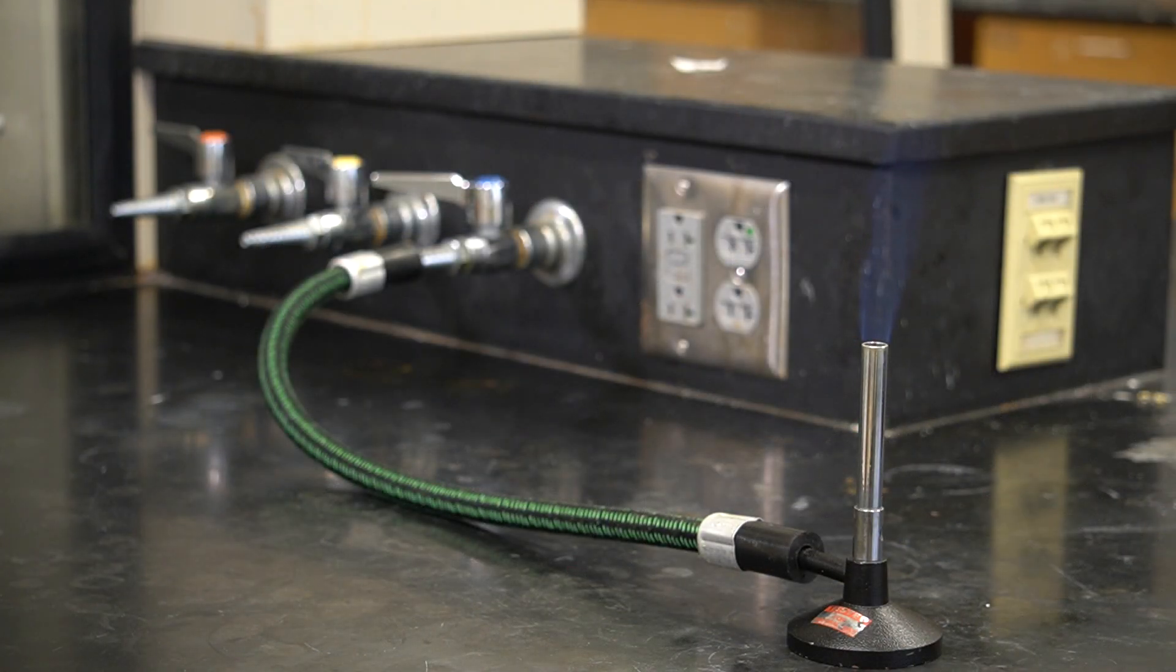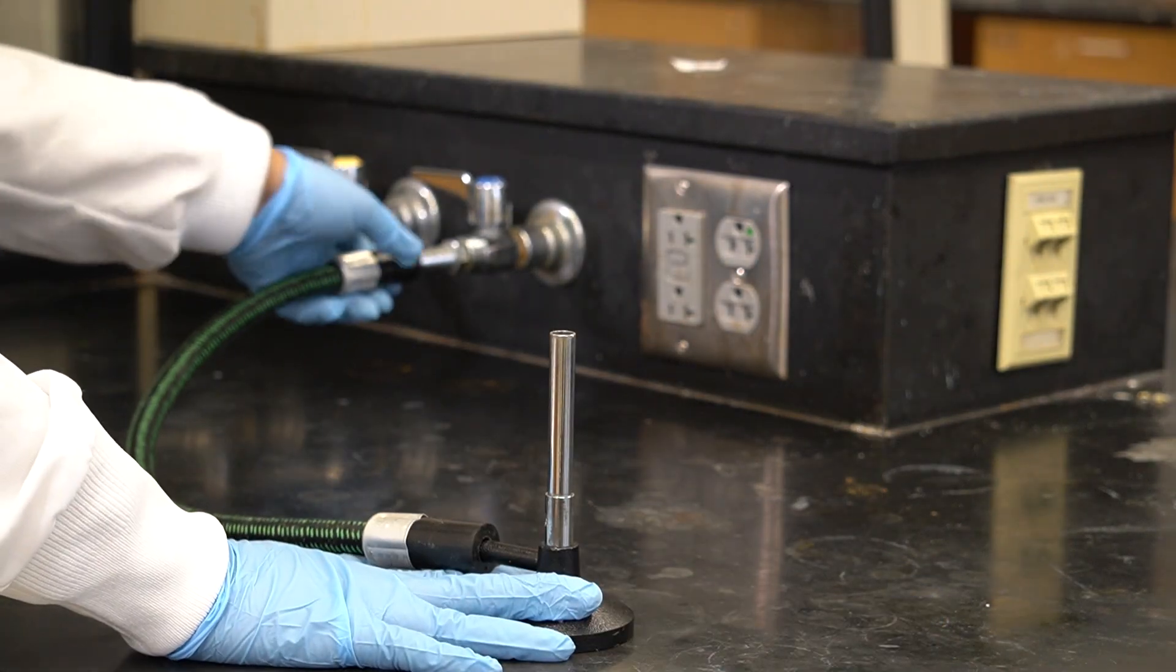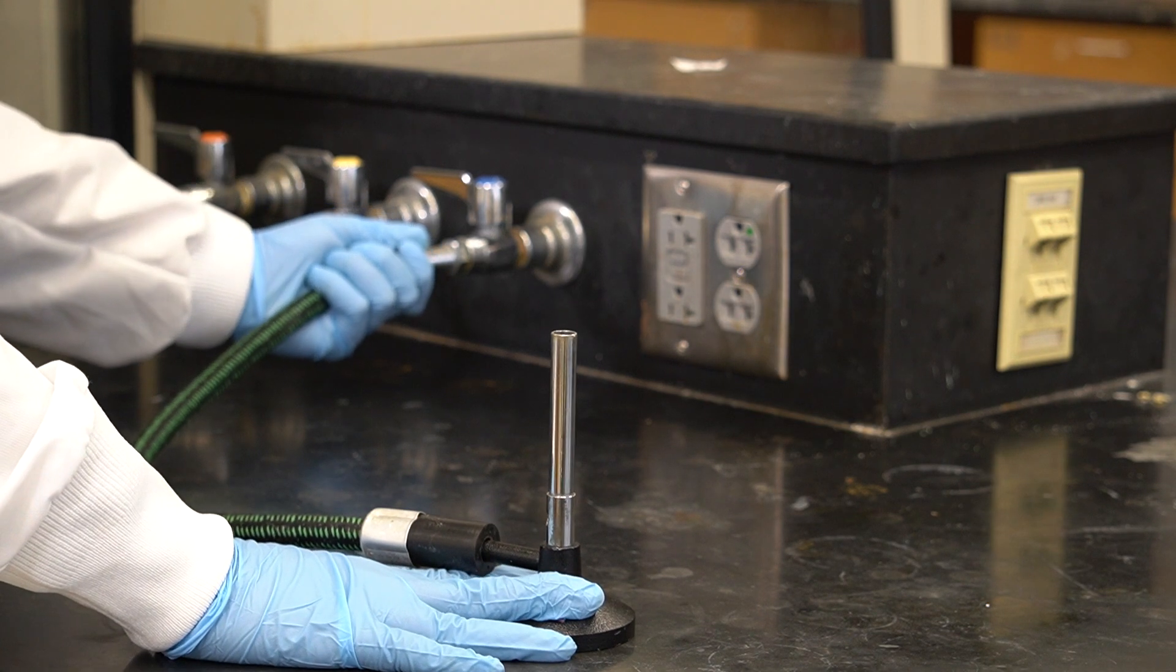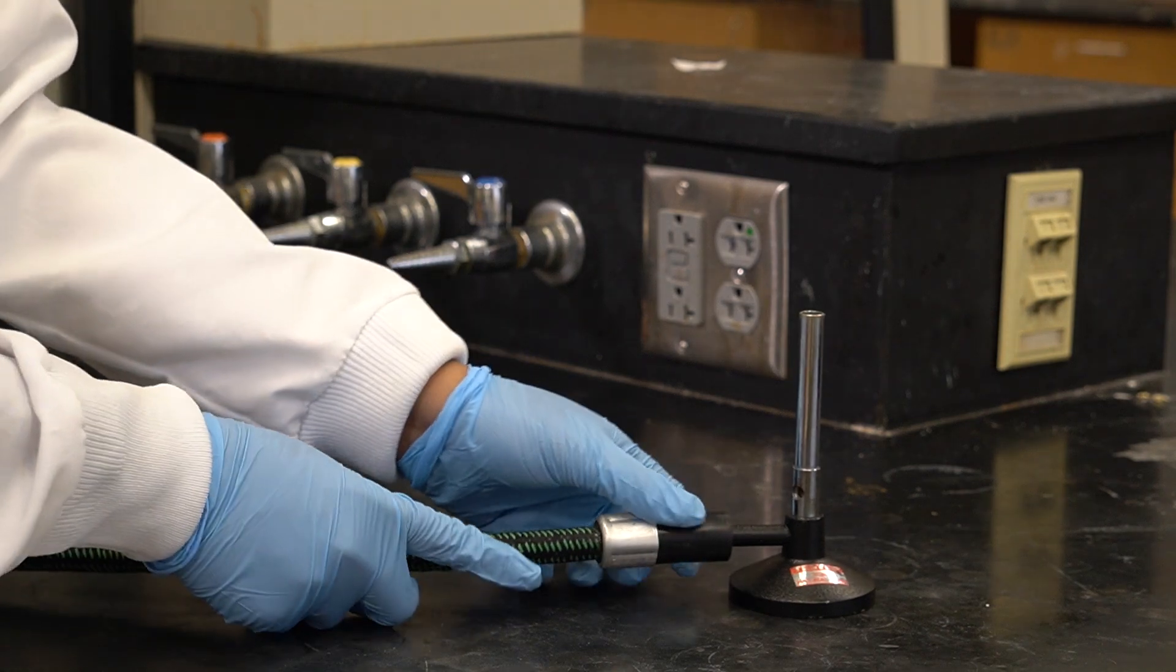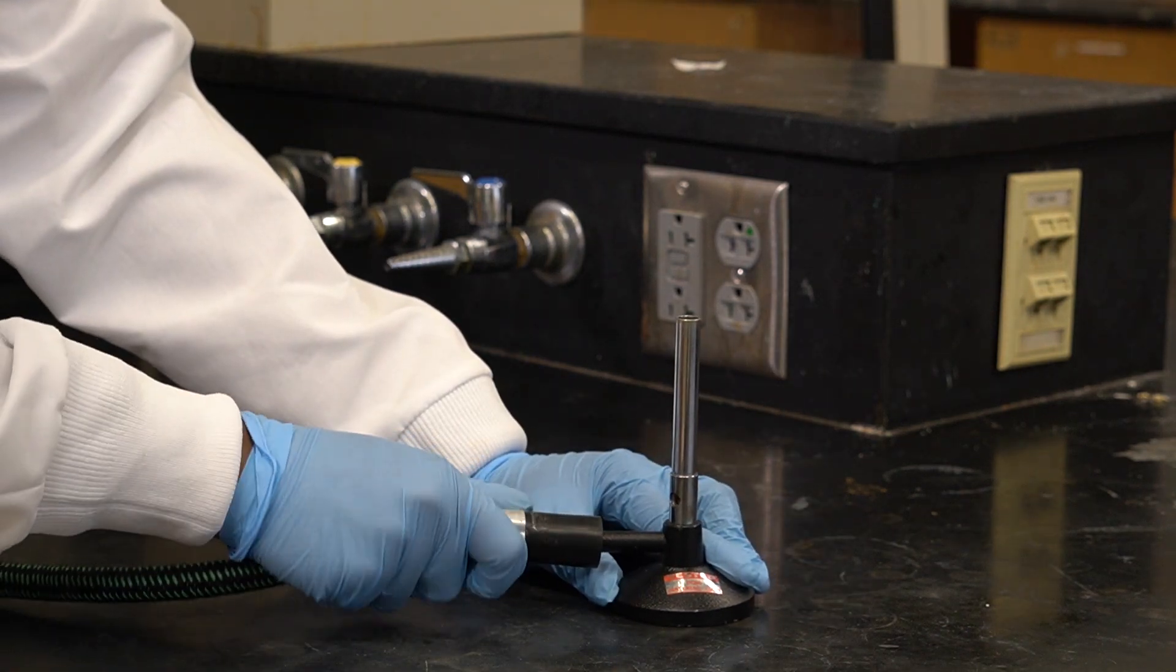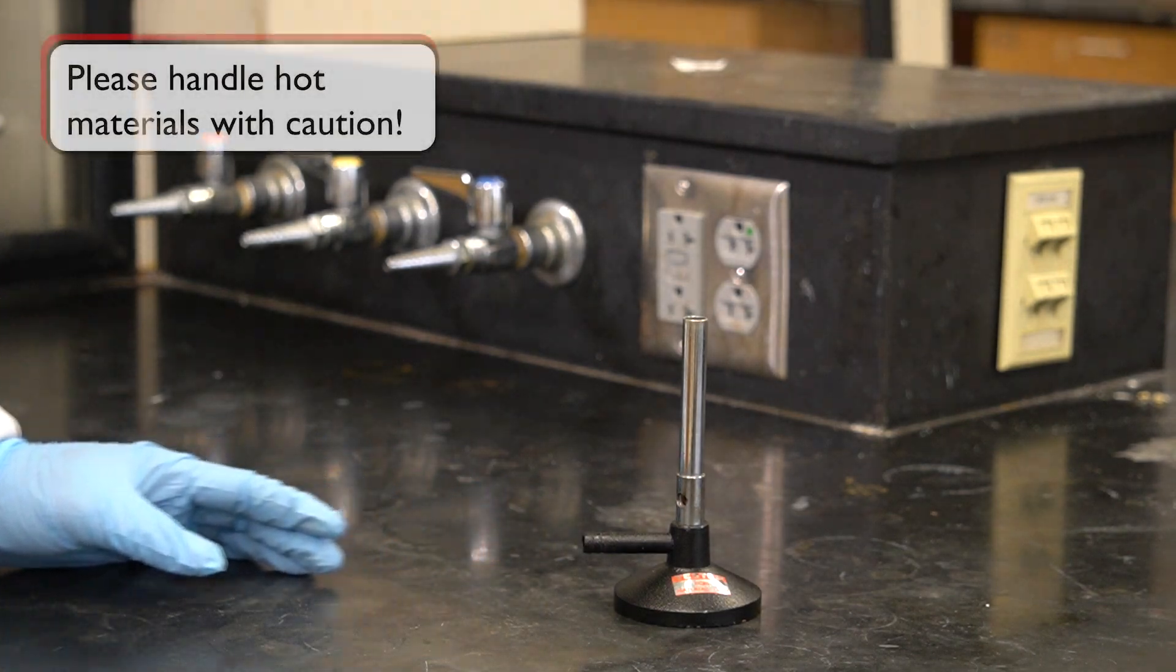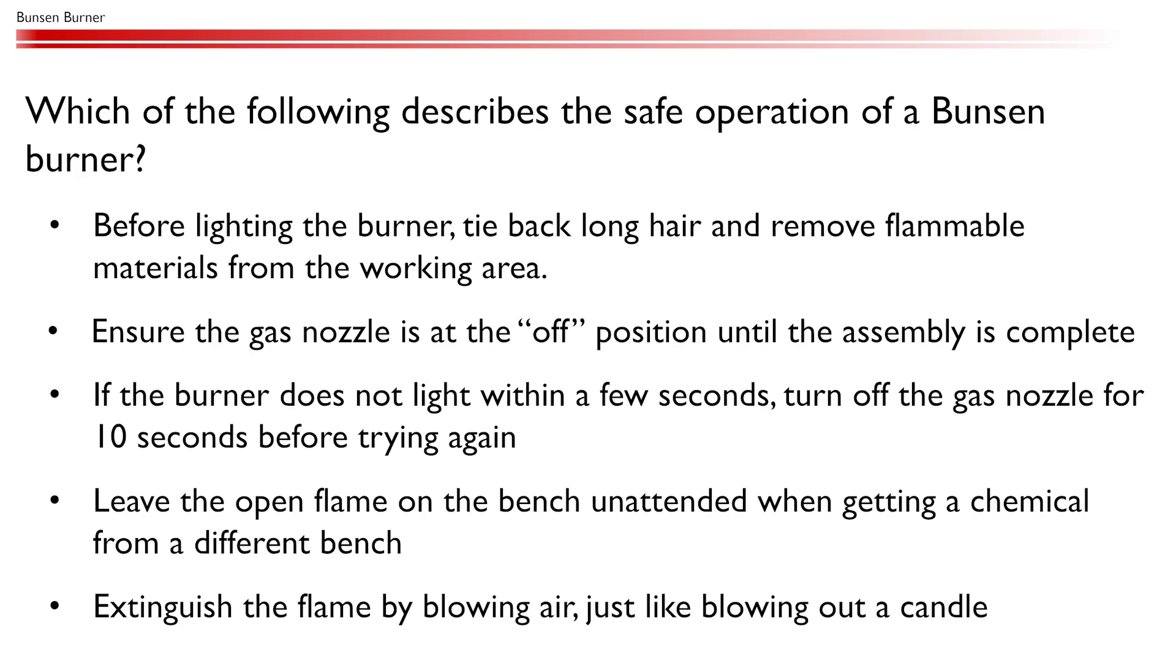To disassemble the burner, first turn off the gas nozzle. This will extinguish the flame. Please be careful when handling the equipment as it may be hot from our use. We can stabilize the burner by its base to avoid touching the hot metal. Remove the tubing from the gas nozzle at our workbench and from the gas inlet on our burner. It is very important to handle hot materials with caution. Which of the following describes the safe operation of a Bunsen burner?